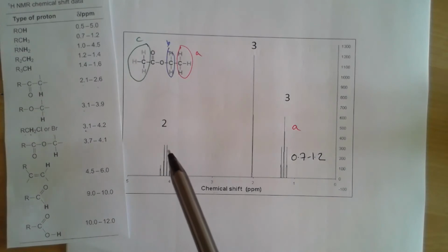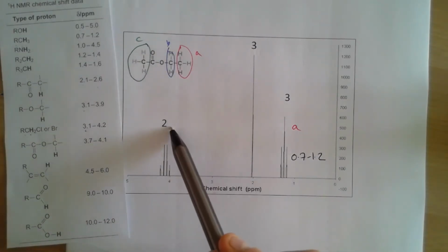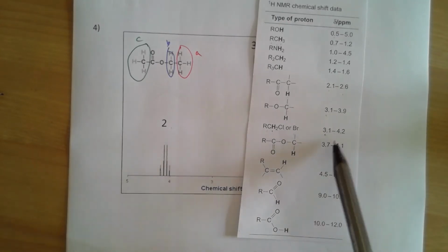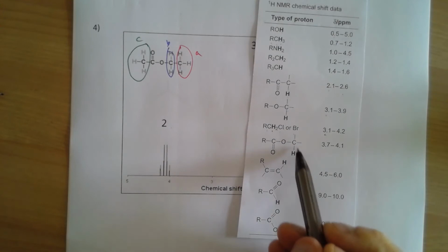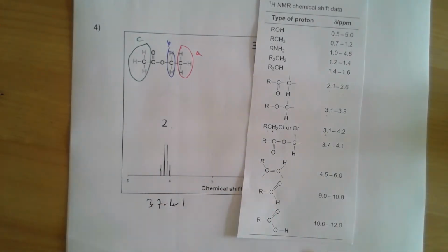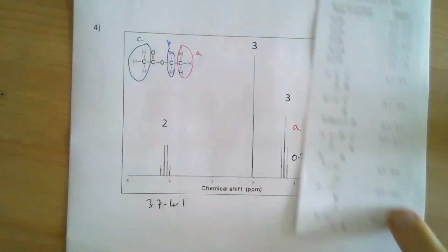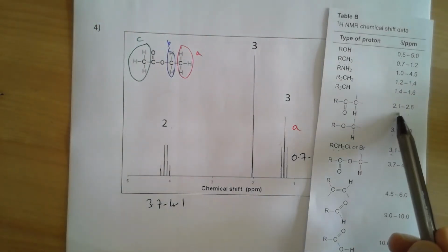Environment B is a 2 hydrogen environment, which we can tell from the integral, and it's being de-shielded, within the range of 3.7 to 4.1, which we're expecting to see there as a result of this group here. So 3.7 to 4.1, and then our final environment here, that singlet, is environment C, and that again is within the range that we're going to expect here of 2.1 to 2.6.